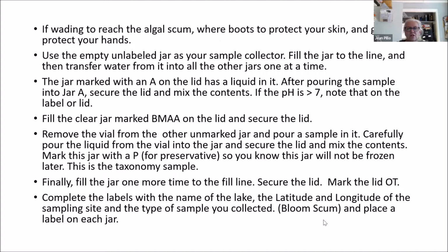Okay. So if you're collecting from the shore and you're going out to collect a potentially toxic substance, I urge you to wear boots to protect your skin, as well as the gloves to protect your hands. If you're going out in a kayak or something, then the kayak will protect you, except for your hands.